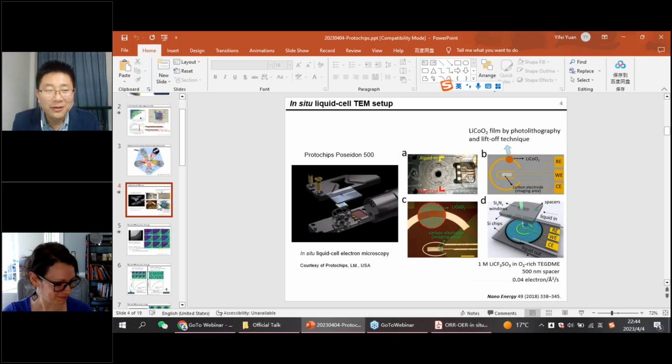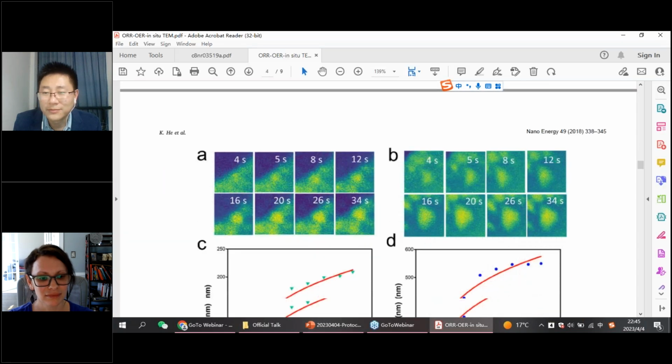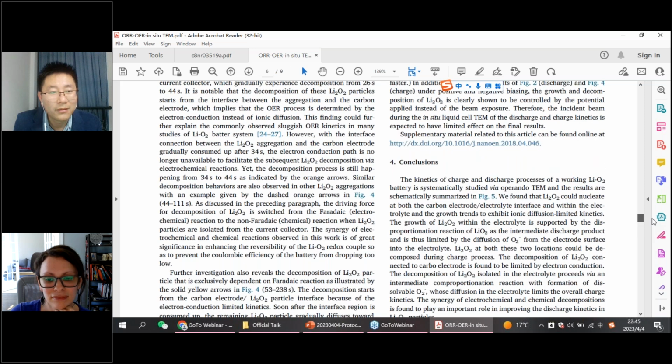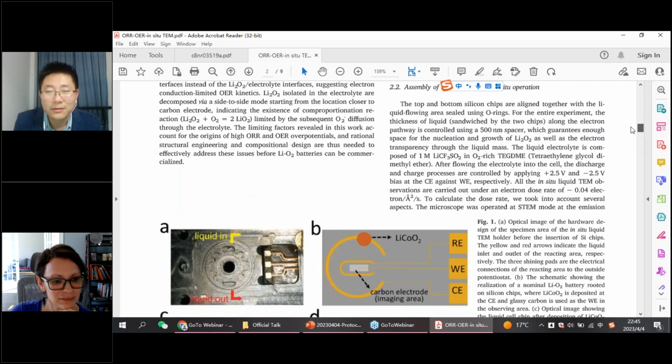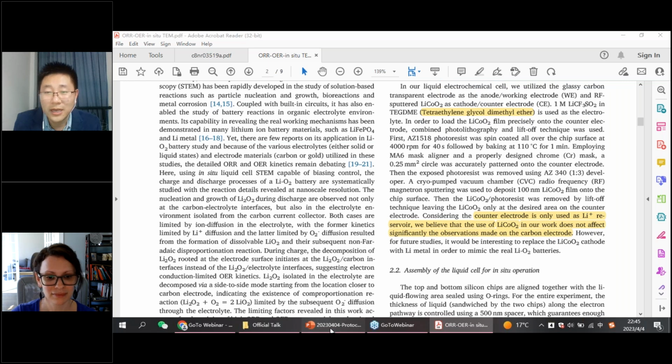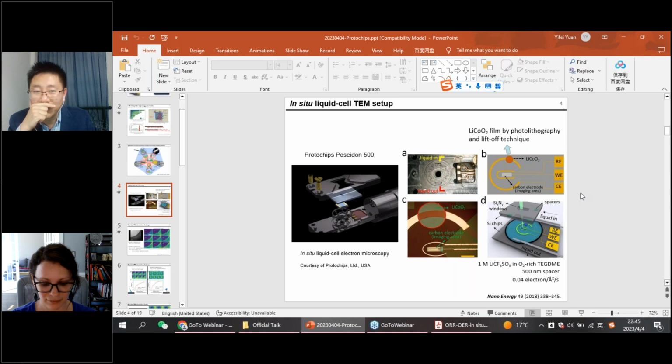Yeah, okay. Well, that's a very good question. And actually in our work, that is the most challenging part. We tried a lot of times, but the deposition was not that successful at the very beginning. For the deposition part, we have a very specific person, an author from UIC who did this work, and I believe we discussed a lot of details in the paper. We use photolithography and also lift-off techniques to prepare this material. But I'm not quite familiar with this technique, so maybe we can refer to the paper for more details.